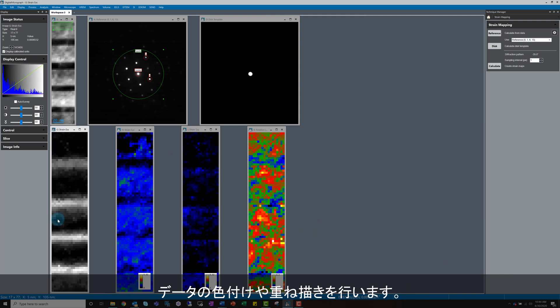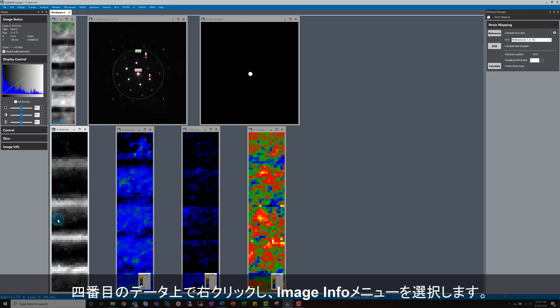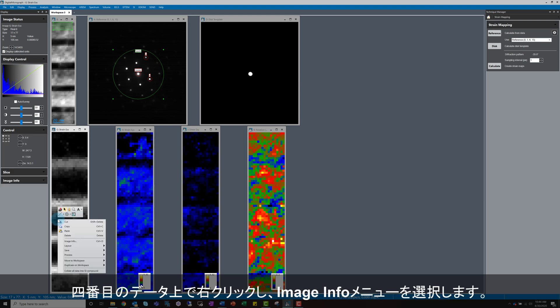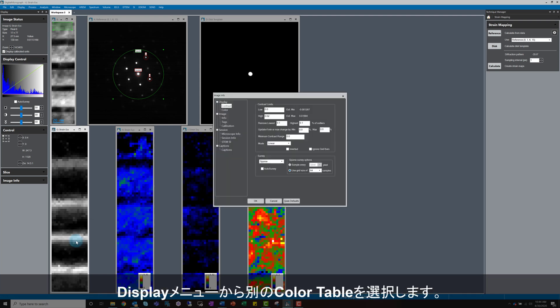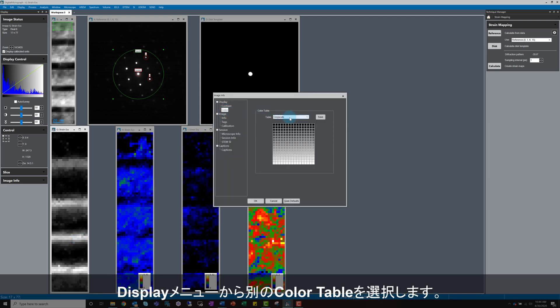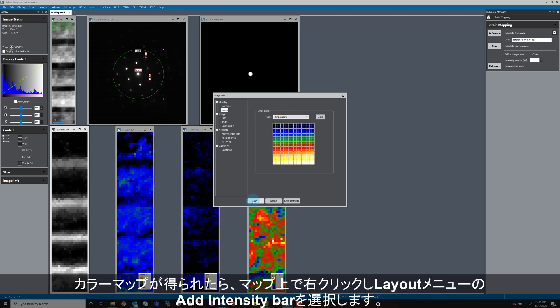It's also possible to go on and overlay in some cases where overlaying makes sense. I've colourised three of the maps already. For demonstration, I'll colourise the fourth map by selecting a different colour table from within the image info window, as you can see here.